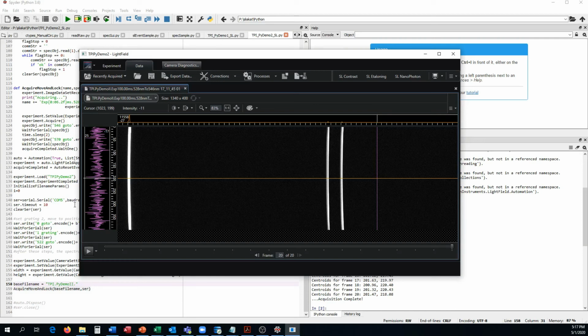So this is again my personal opinion. I hate LabVIEW. I don't like programming in it. A lot of labs use it, but it's for data science and for hardcore analysis. I'm not a big fan. And when it comes to debugging code, I'm not a big fan either. Again, it's just my personal opinion.